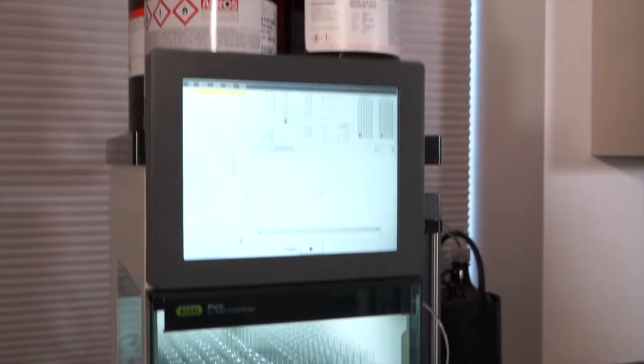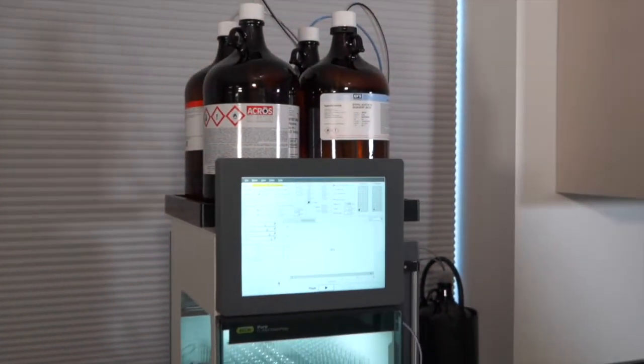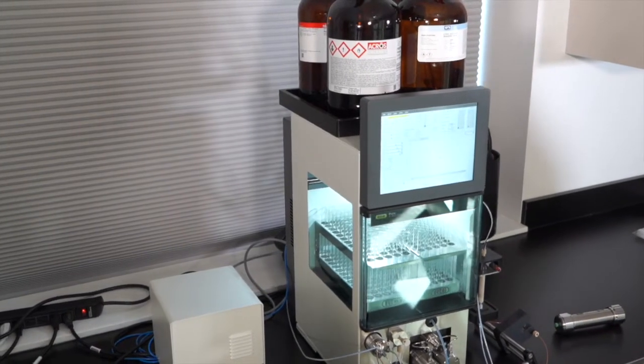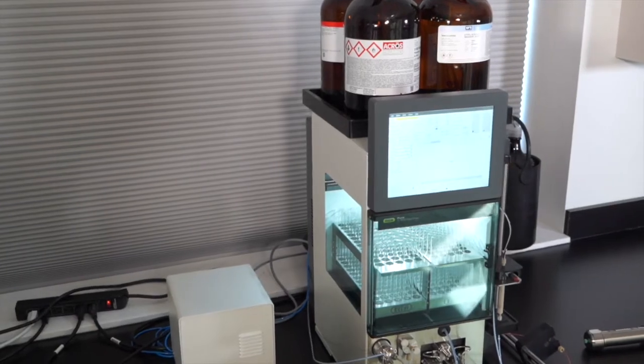In addition to the Pure's compact design, Buchi offers a solvent platform which can accommodate four 4-liter solvent bottles on the top of the instrument, freeing up even more space.